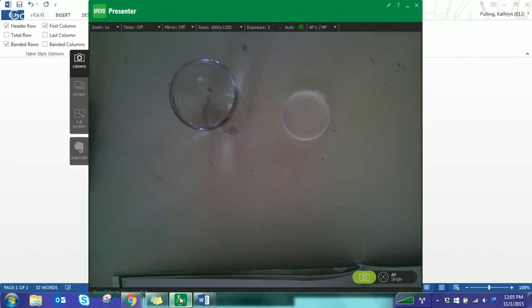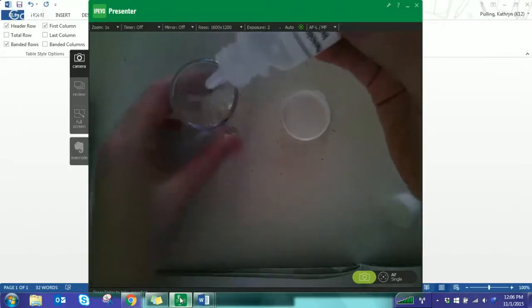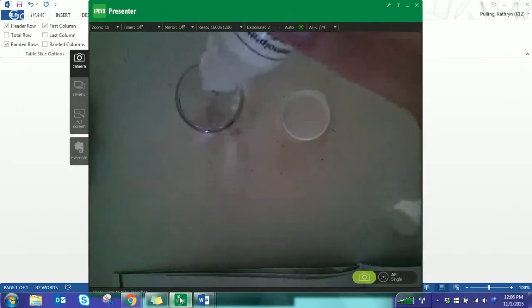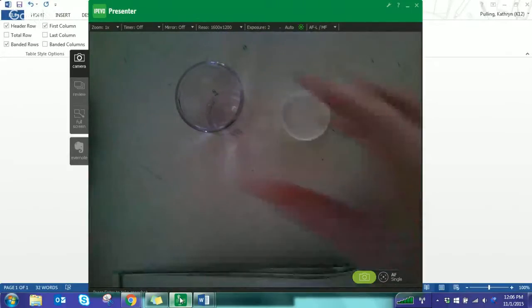So phenolphthalein, that has a seal to break as well. Yep. All right, so with working with the droppers, don't squeeze until you have it flipped over. That way you can keep a good count on how many you add. So there's 1, 2, 3. I didn't even have to squeeze to get it to drop.